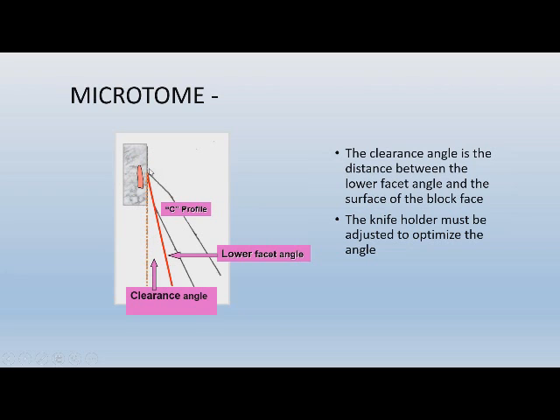If I face the block too much like that, I literally can just rub up and down it and make no sectioning. Now if I move my angle out, this becomes larger, hence you go from 2 to 4 to 6, whatever.